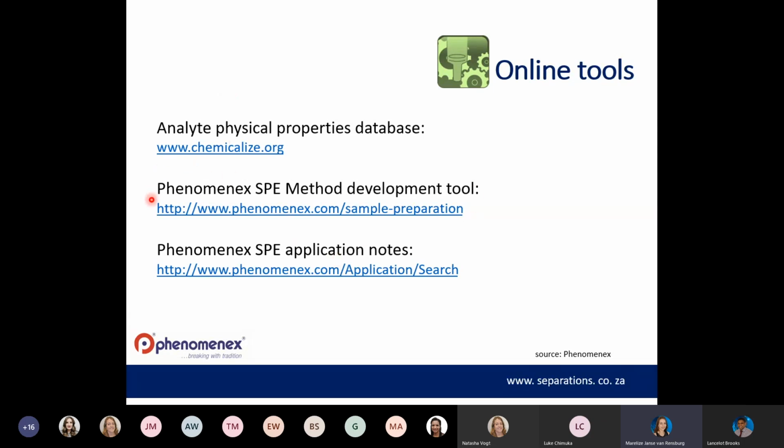The Phenomenex SPE method development tool is a great website where you can populate some of the properties of your analyte, and it will give you a recommended SPE sorbent to try, as well as the correct bed mass. And then lastly, there's quite a lot of SPE application notes available. So if you are struggling, please reach out to your representative. They should be able to assist.